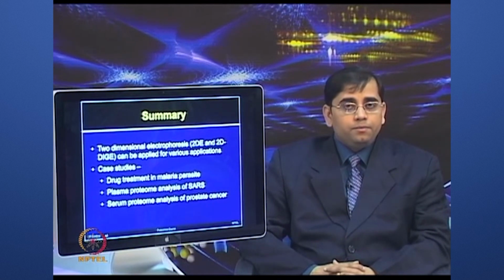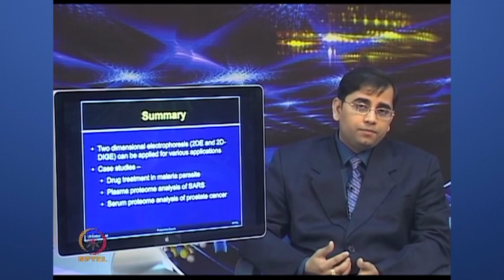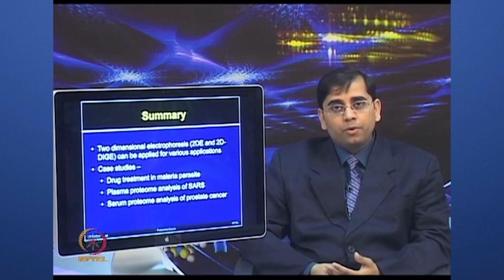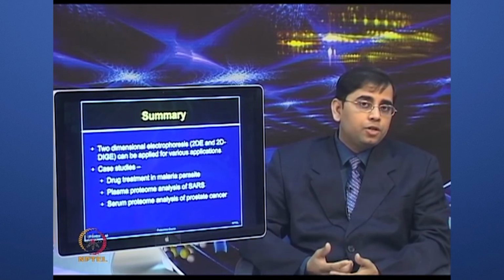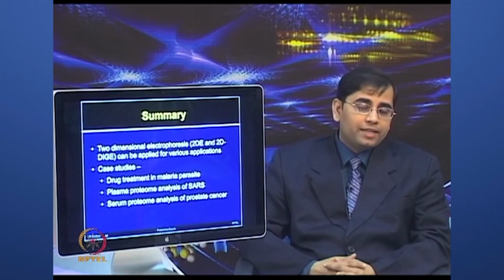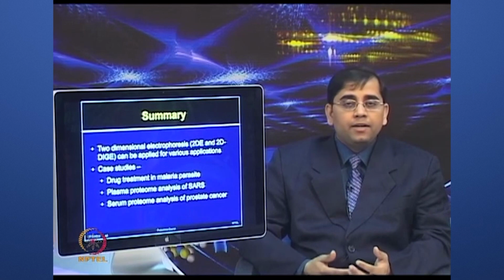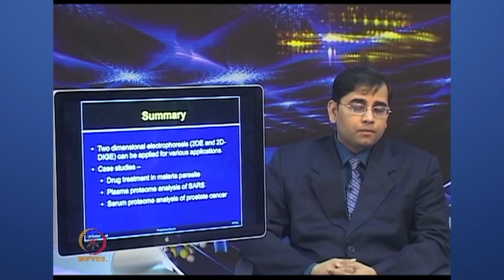So, in that regard, you would not have noticed too much difference in the overall applications, whether we have talked about plasma proteome analysis based on the conventional 2DE or a serum proteome analysis of prostate cancer based on the DIGE technique, because at the end you want to establish the identity of the proteins by using mass spectrometry approaches.